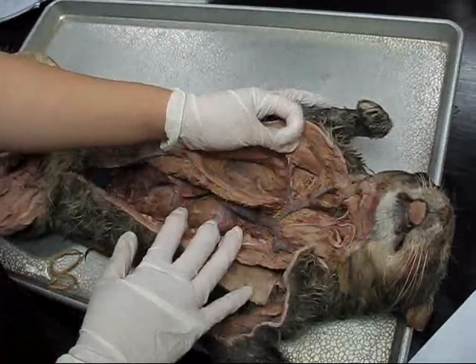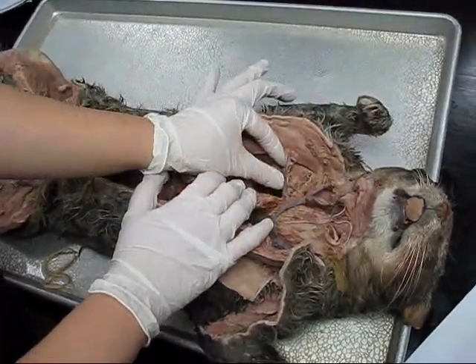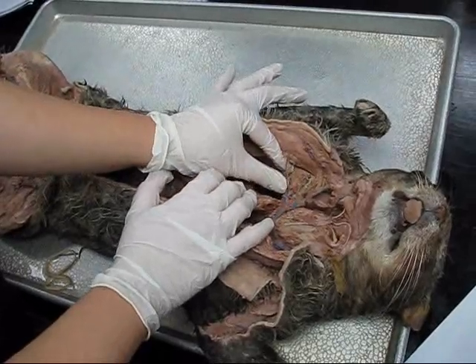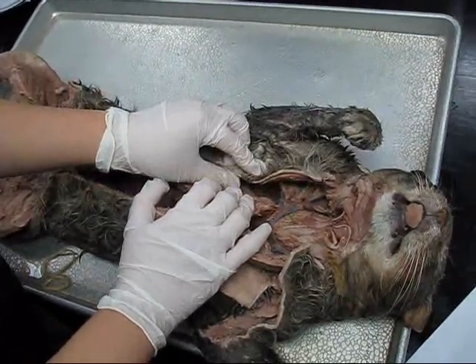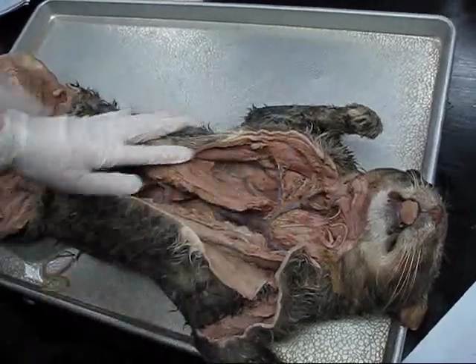This is going to be the right transverse scapular because it's on the right-hand side. Where it's kind of near the armpit would be axillary. And as far as brachial, it would be further off, closer to the arm, but this specimen just doesn't show it that well.